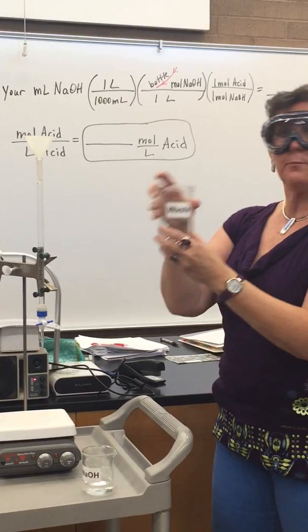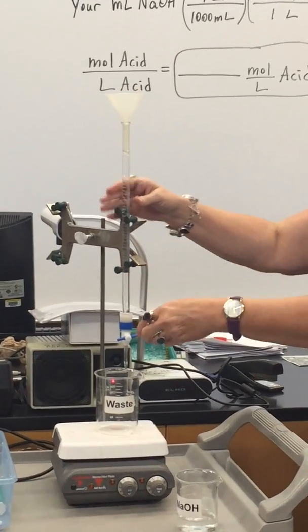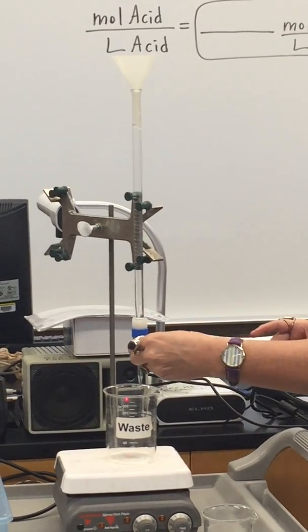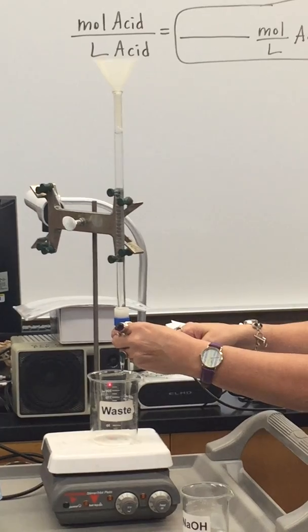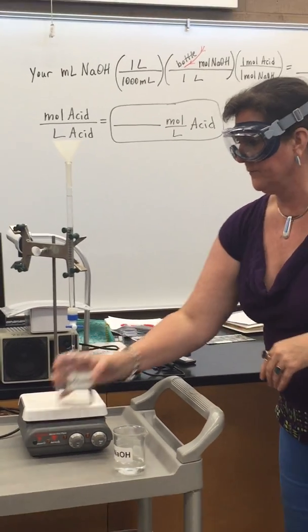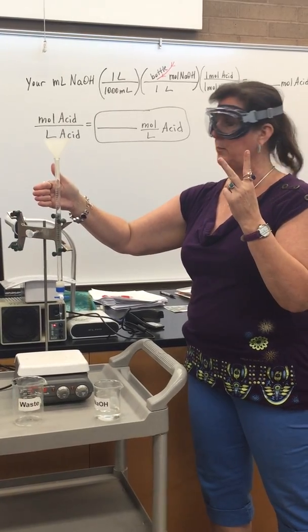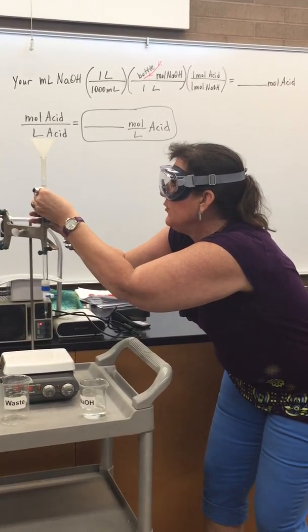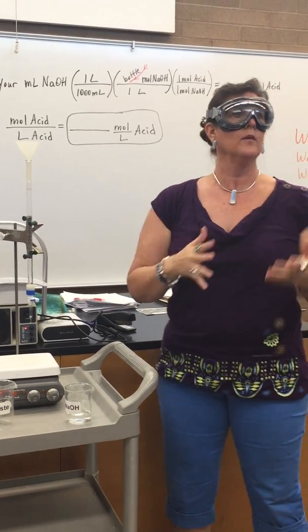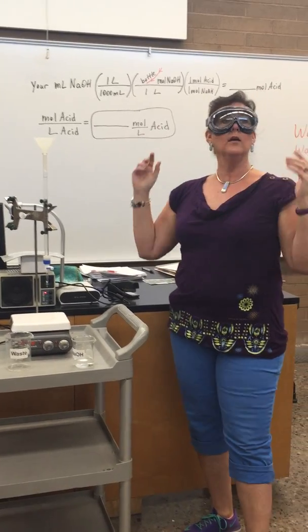Then we're going to take our waste beaker, put it underneath the burette, and lower the burette down. We're going to lower it to close to three — you don't need to get it exactly on three, but somewhere around two to three. That's to get the air bubble out of the tip. I've got the air bubble out of the tip; I'm around two and a half — good enough. Now I'm going to take my initial burette reading and it needs to be to two decimal places. Mine is at about 2.32. So we're going to start somewhere around two to three, record it exactly. That's our initial volume and our burette is ready to go.